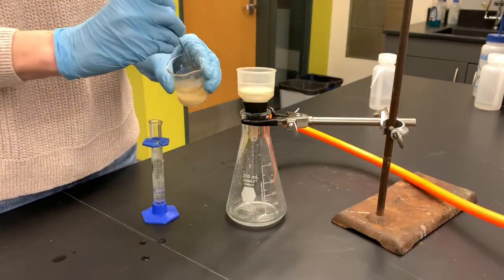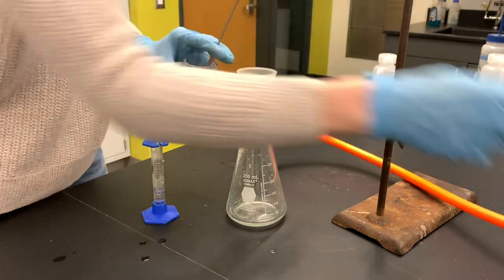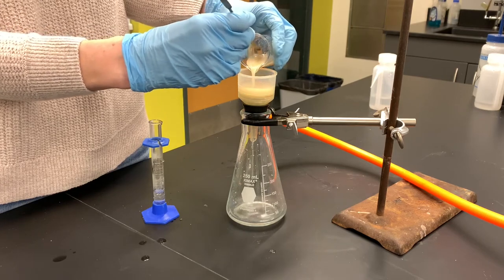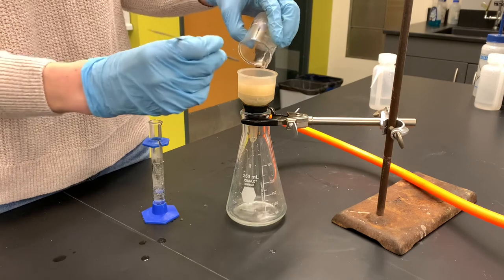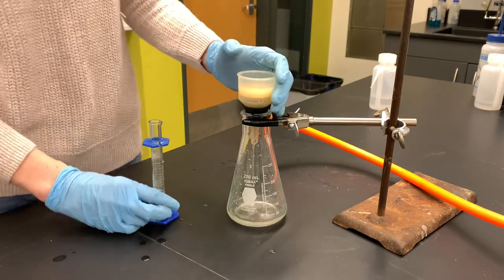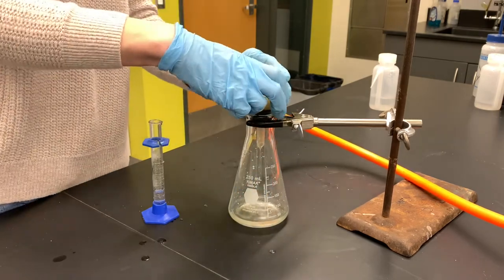These crystals have been sitting in ice and they are ready to be filtered. I've already got the filter paper pre-wet. I'm using a little bit of that 50% ethanol solution. In general, when you are recrystallizing, you wanna wet your filter paper with the same solvent that you use for recrystallization, and also rinse with the same solvent as well, although we want it to be cold instead of hot.